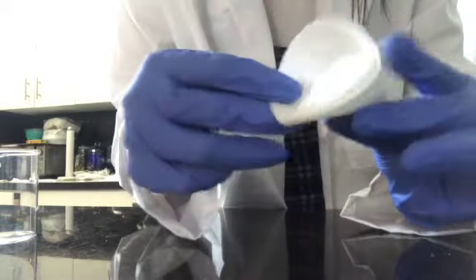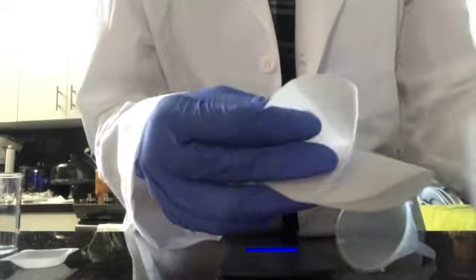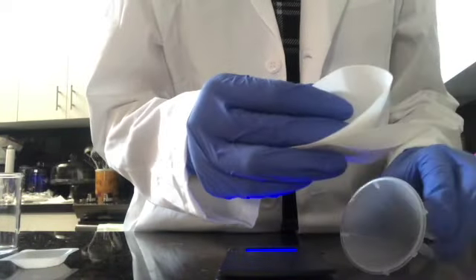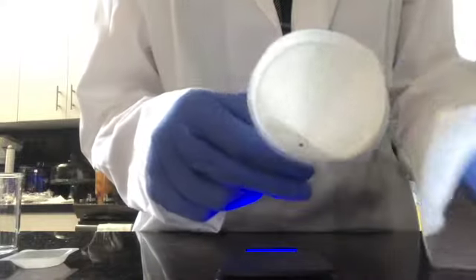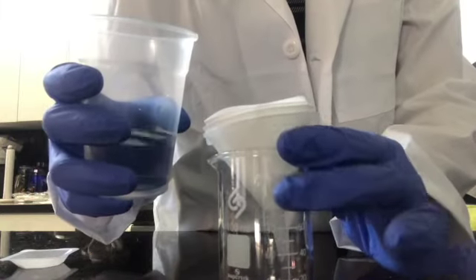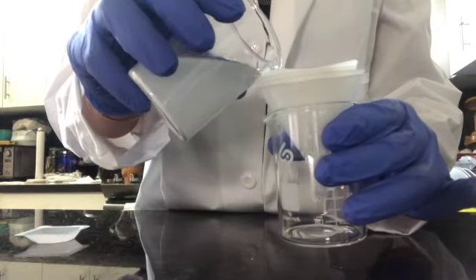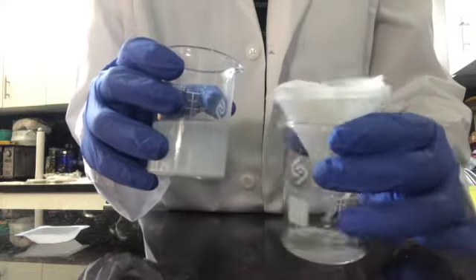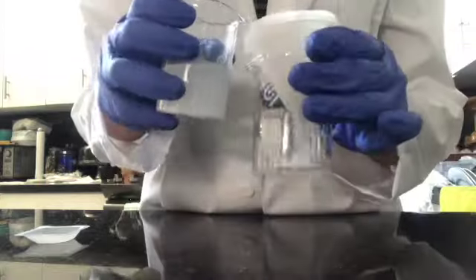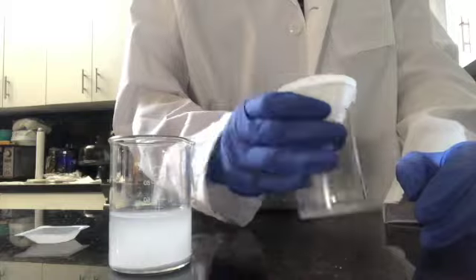Fold and round filter paper into a cone shape. Place the folded filter paper into the funnel and damp it with small amount of distilled water. Swirl the contents of the beaker to dislodge any precipitation with the sides, and while holding the filter paper open, slowly pour the contents of the beaker into the filter paper lined funnel.